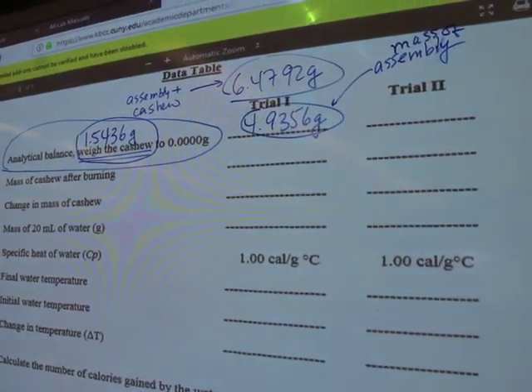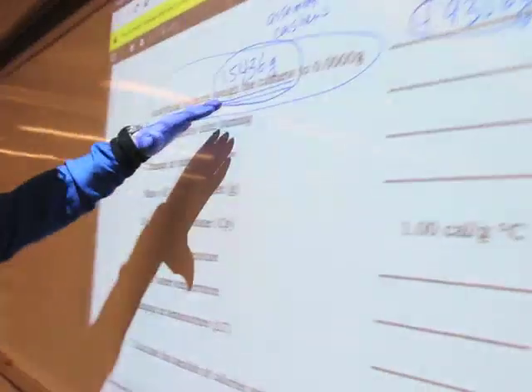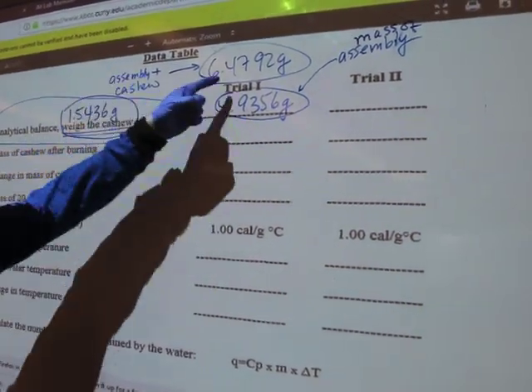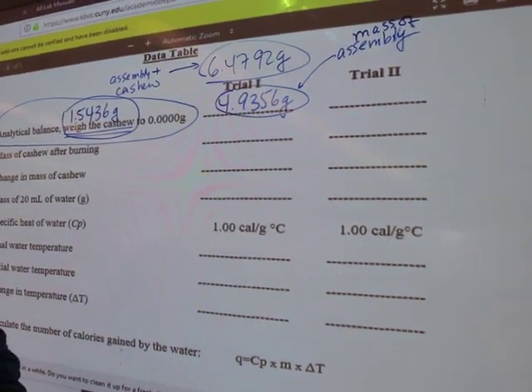After I read the procedure, I realized the data table here is incorrectly assembled, so I had to do some modifications on the fly. One of the modifications is I need to get the weight of the cashew by itself.